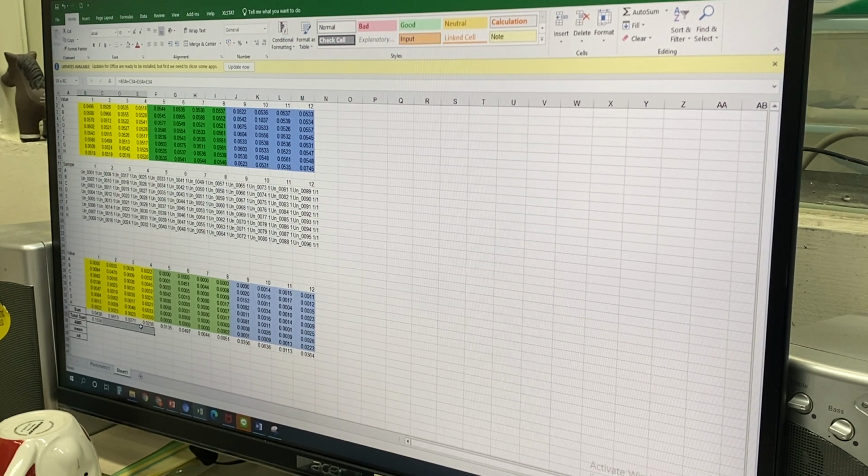So you can just merge it, okay? Like this you can also do this one, because this one you can see that F30, FGHI, you can see FGHI, so they become FGHI. Okay.